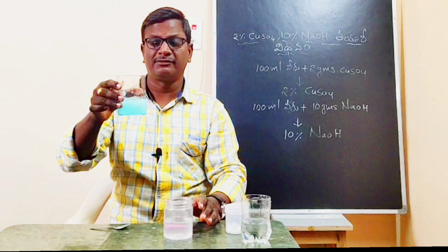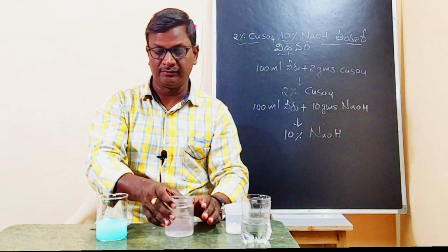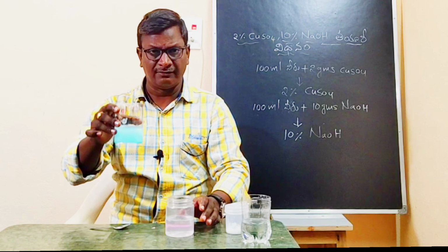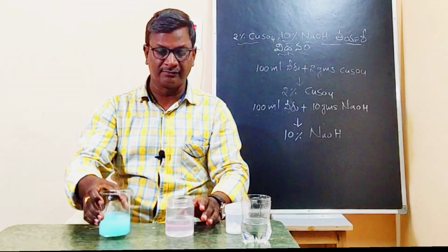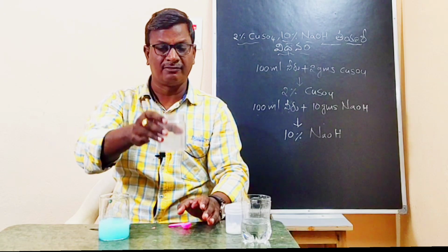This is 2% copper sulphate. This is 10% sodium hydroxide. 2 grams of copper sulphate dissolved in 100 ml of water. 10 grams of sodium hydroxide dissolved in 100 ml of water.